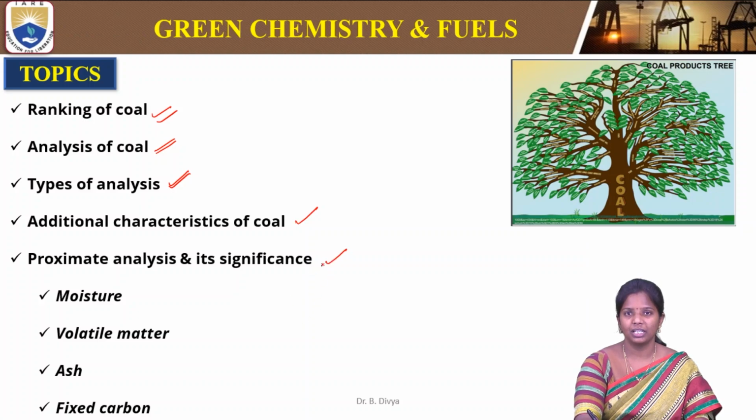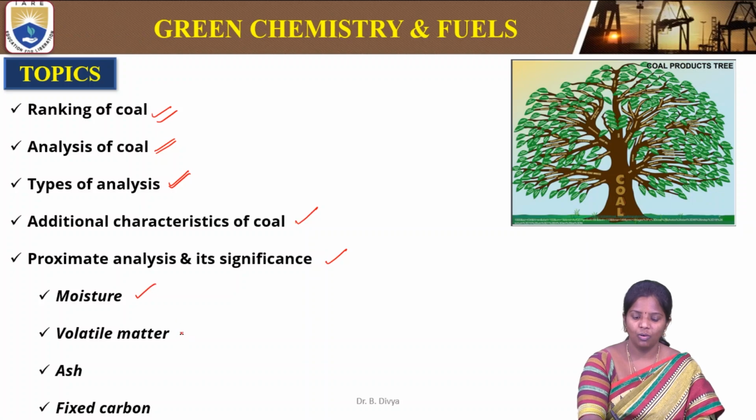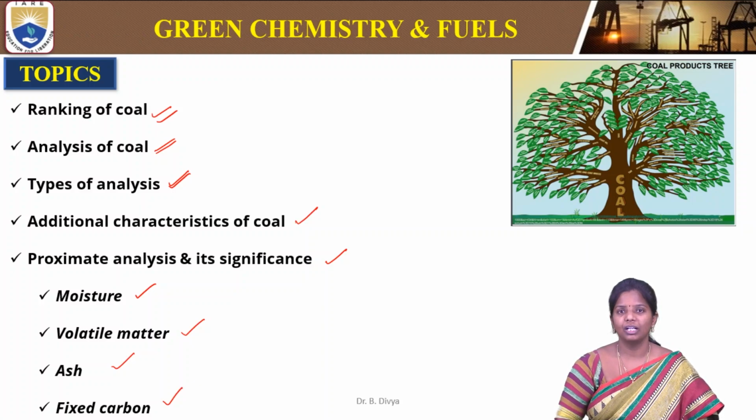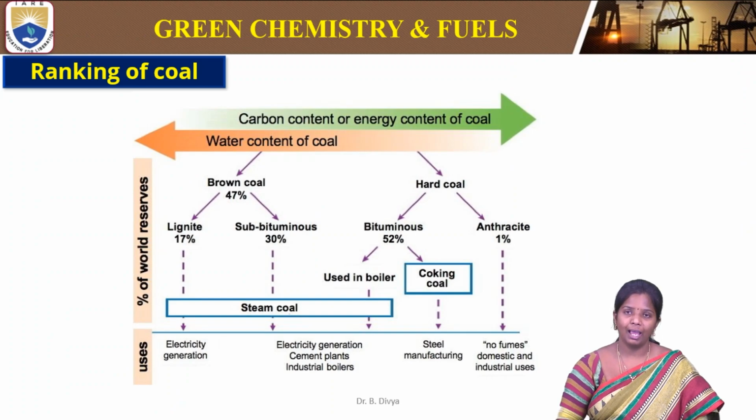In this proximate analysis, we have moisture, volatile matter, ash and fixed carbon content. There are a lot of products from coal, so it is very useful and mandatory to analyze coal before we use it for any application.